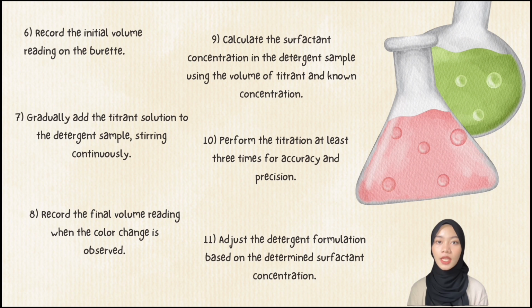Next, perform the titration at least 3 times for accuracy and precision. And lastly, adjust the detergent formulation based on the determined surfactant concentration.